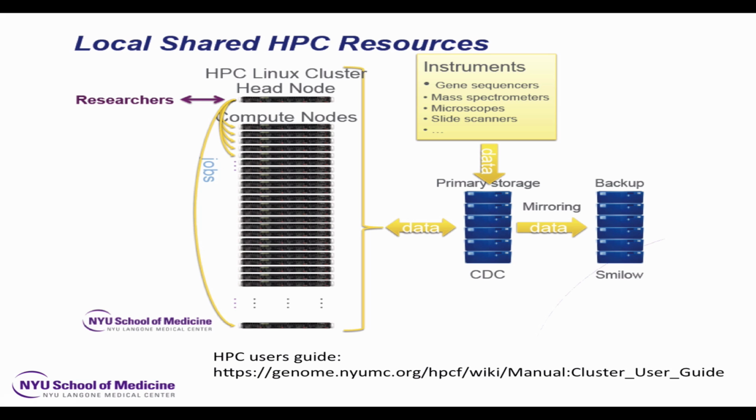Here at the medical center, we have a high-performance computing system where you can access a significant amount of iron, lots of CPUs with lots of RAM, and get through an RNA-seq analysis in a few hours with a relatively large number of data files. In fact, because we have a batch system, you could submit separate jobs for each sample. Each FASTQ file that's generated, run them all in parallel.